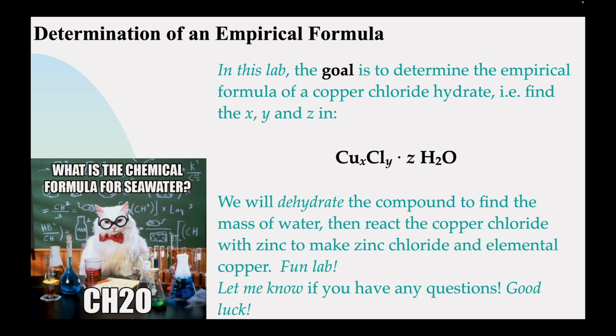And we'll even talk about what's called a theoretical yield and actual yield, which is what chemists use to figure these things out. And the percent yield will tell you how efficient your reaction was. So it's a pretty cool lab. It introduces some real powerful tools for chemists who want to figure out how much product is made.